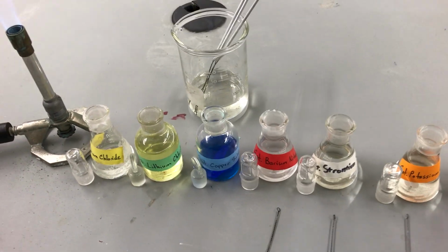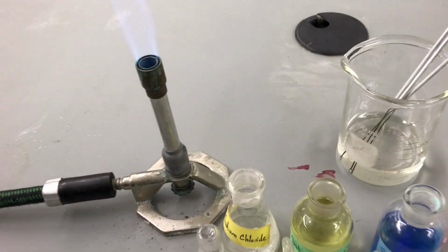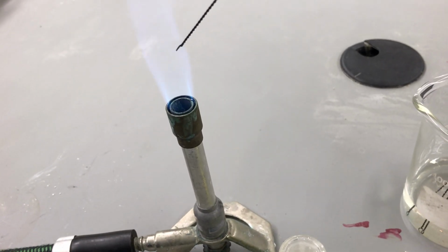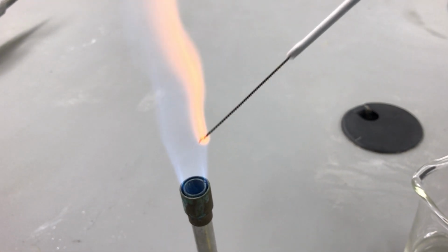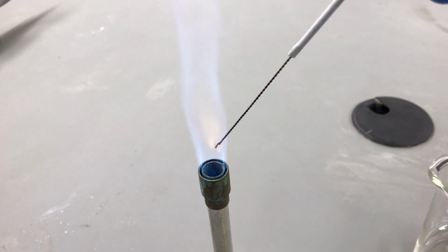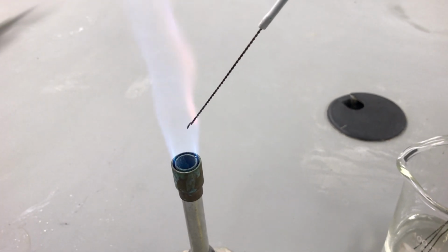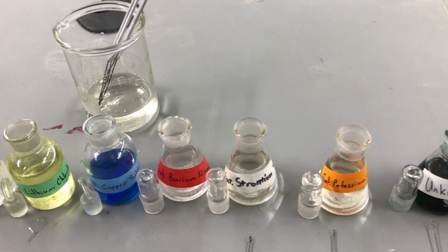Next up, we have barium nitrate. So once again, introducing it to the flame. Barium, it's pretty quick, but you can kind of see it's got a little bit more on there. Kind of a yellowish with a slight greenish tint. So once again, it's a very quick flash, but once again, that kind of yellowish with a slight hint of green to it. It doesn't last very long. So once again, barium nitrate was the yellow-green, more yellow than green, but there's a little flash of green in there.